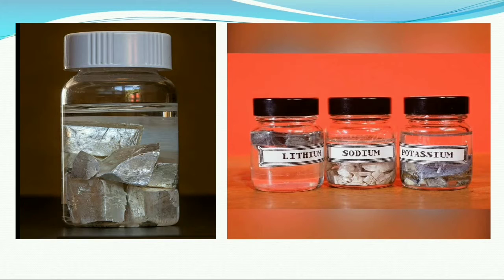So this is the sodium which is stored under kerosene, and along with the sodium we can use lithium and potassium because they are extremely reactive even with the water present in the air. So that's why we should always preserve them under kerosene.